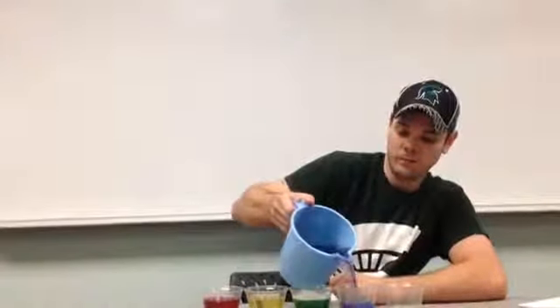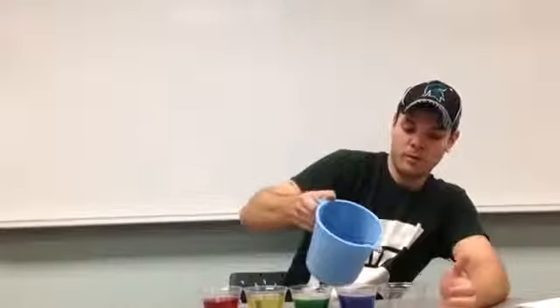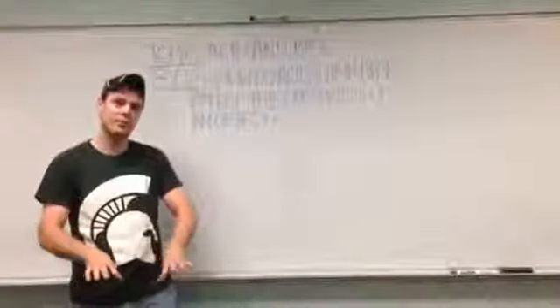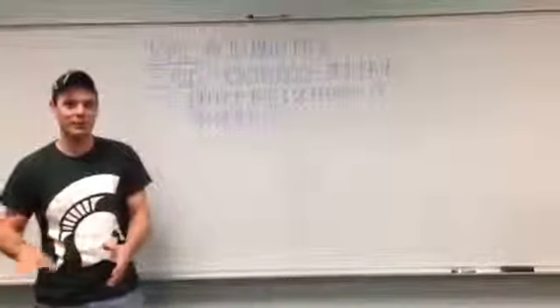I want this one to be green right here. And then next is blue, and then purple. Ta-da! You just witnessed our beautiful magical experiment with our magic water.